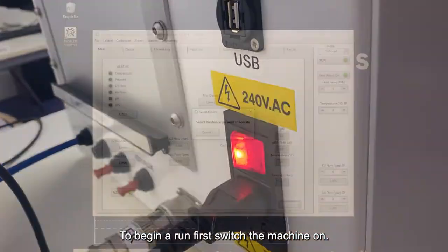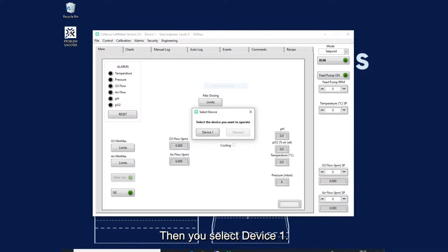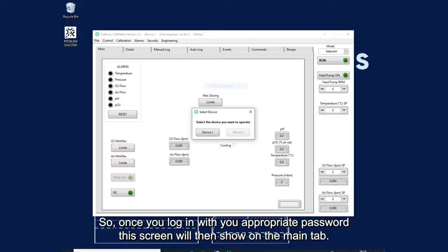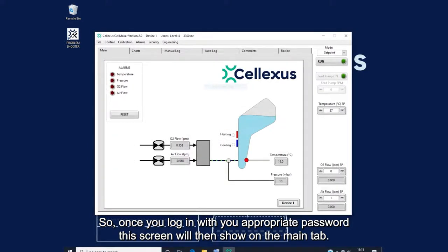To begin our run, first switch the machine on, then you select device 1. For device 2 options, it's for our dual controller, which can control two enclosures with the one controller. So once you log in with your appropriate password, this screen will then show in the main tab.